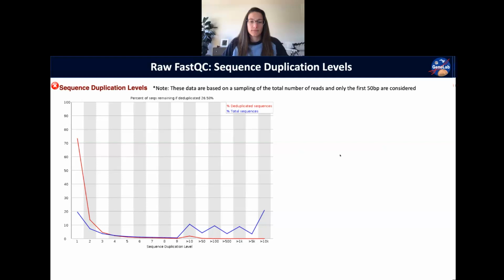One, which I haven't talked about yet, is actual biological duplication. If you have a transcript that's highly expressed, so there's a lot of copies of that transcript, when we go through that first step of library preparation, after we remove ribosomal RNA, and then we start chopping up the remaining RNA to get our short inserts that we're going to sequence, using metals, a divalent cation, that's actually used to chop up that RNA.